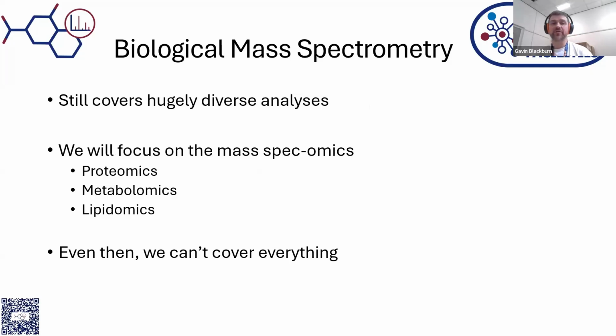So biological mass spectrometry, well, it still covers an enormous range of analyses, from targeted methods, looking for, say, particular drug metabolites in serum samples, all the way up to trying to cover the whole proteome of human beings.